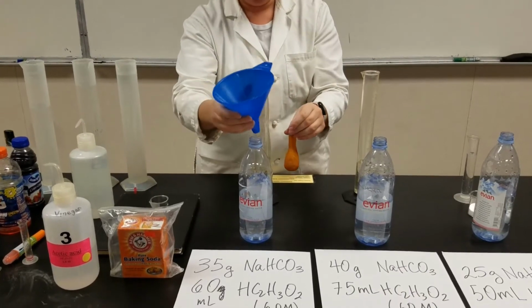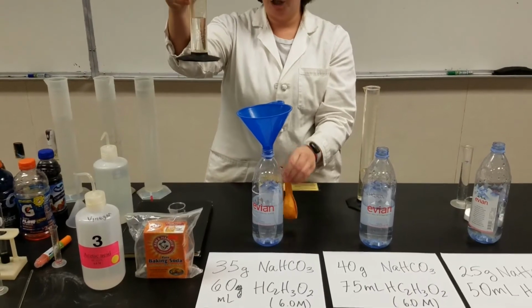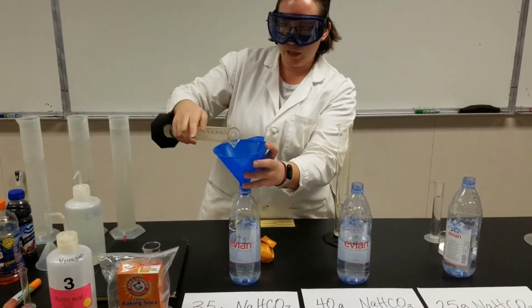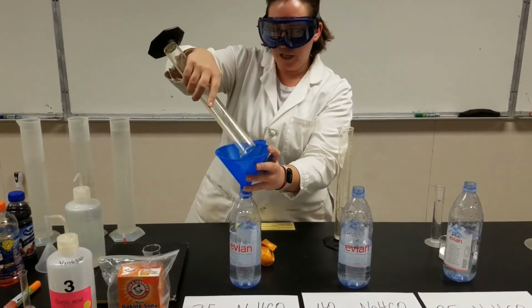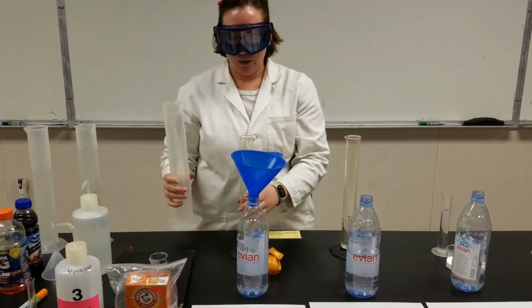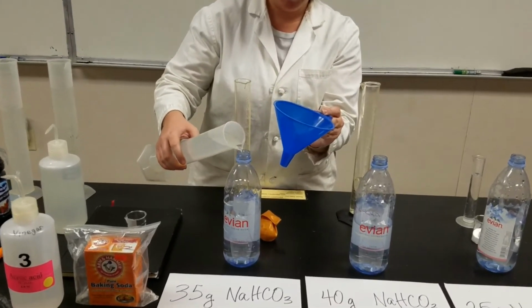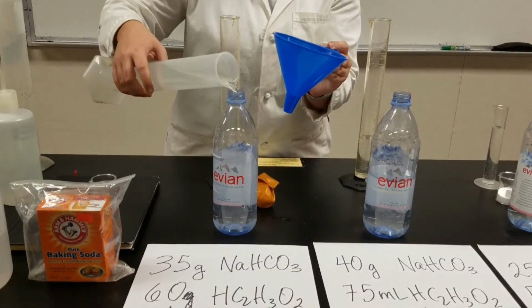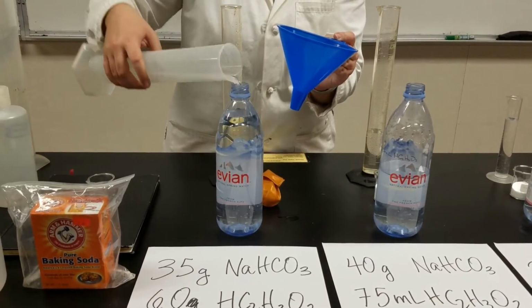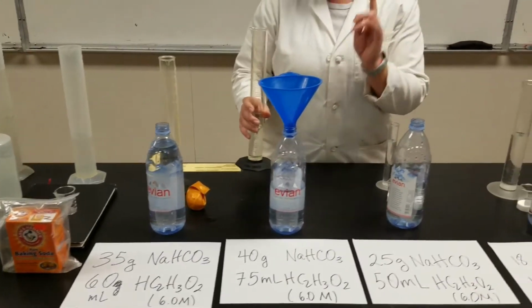Now we have 60 milliliters of pre-measured acetic acid, our vinegar substitute. We're going to add that to our reaction vessel here, which is a very simple plastic bottle. And then we're going to add water. This is tap water, just so that we have a completely filled bottle with no extra space. Okay, we're going to do the same thing for these other bottles.